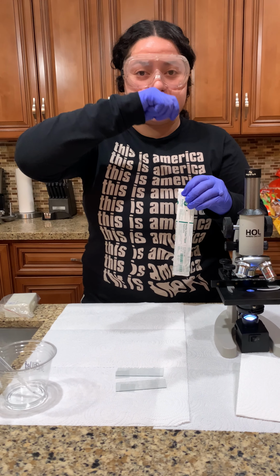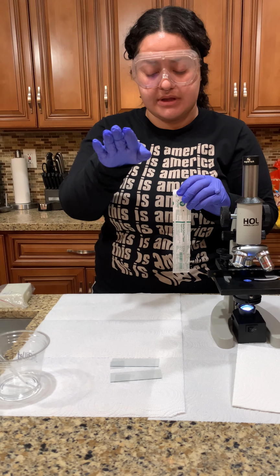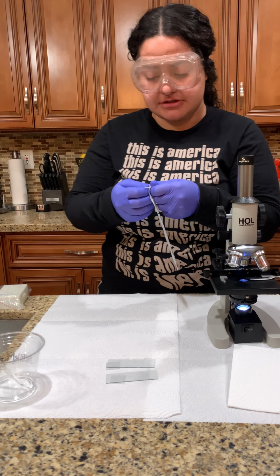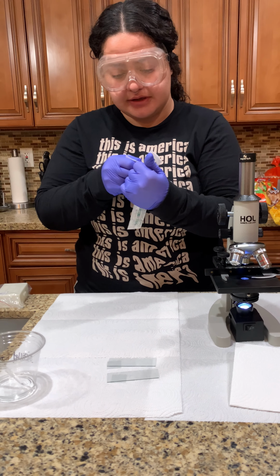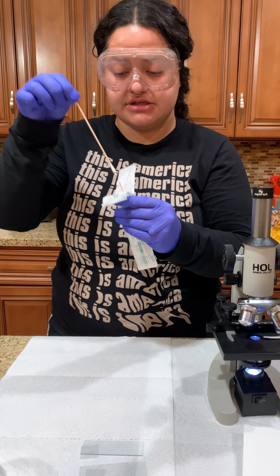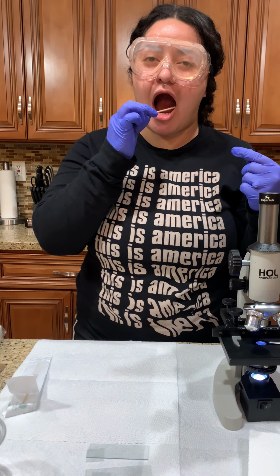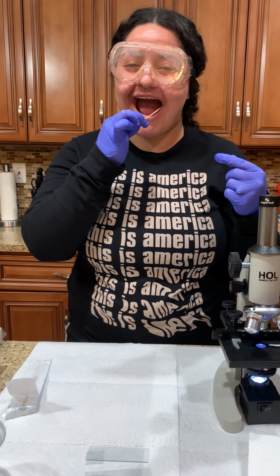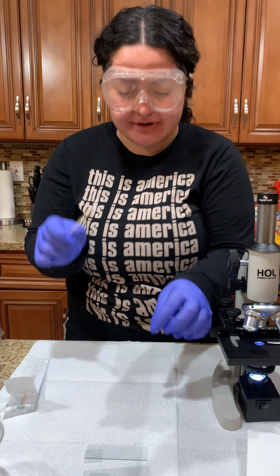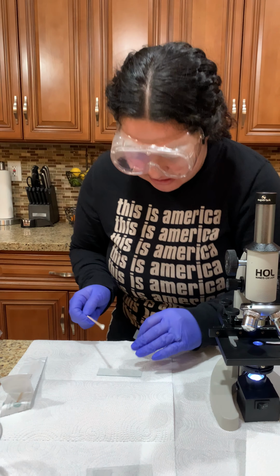So I'm gonna go ahead and swipe my cheek, put it on the slide. I'm gonna put a drop of distilled water and then cover it with the cover slip. And then I'm gonna be able to observe it under the microscope to see any cells. I'm gonna just show you how I'm gonna do that real quick. So I get one of the swabs, and then I'm gonna go ahead and put it into my cheek. It looks weird, I'm sorry. Okay, so I'm gonna go ahead and smear it onto my slide. And I have my slide on top too, okay?